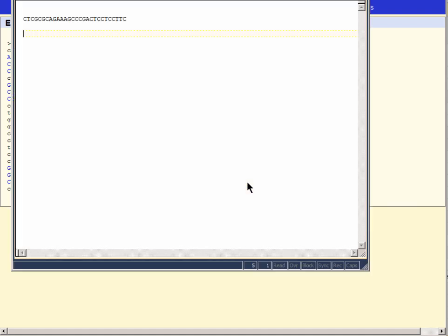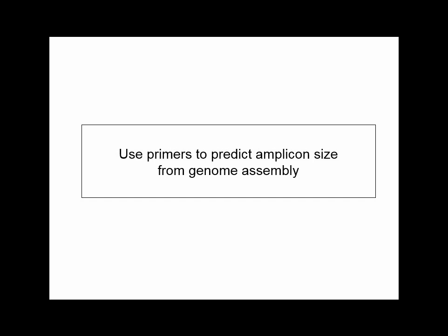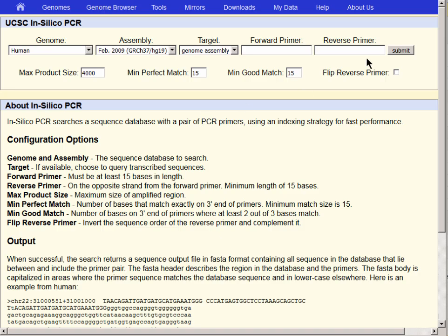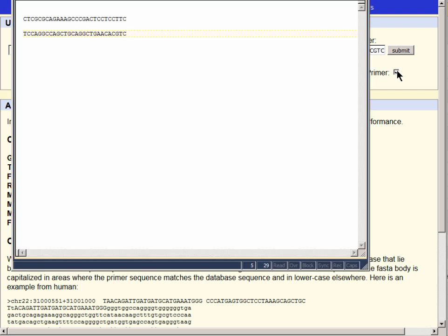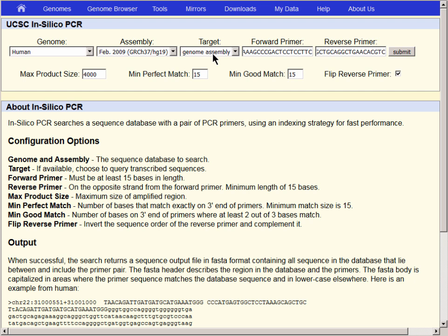Then let's return to the Genome Browser and select In Silico PCR from the Tools drop-down menu in the blue bar at the top. We will paste the reverse primer that's still in our copy buffer into the reverse primer box, and we will flip the orientation of the reverse primer so that the three prime ends of our two primers are facing each other. We're essentially taking the second primer and using it on the lower strand or reverse strand of the DNA template. Going now to the text file, we will grab our forward primer and paste it into the forward primer box in the In Silico PCR tool. Notice that the target is set to the default genome assembly, which is essentially using DNA as a template with any introns included. Now hit Submit.